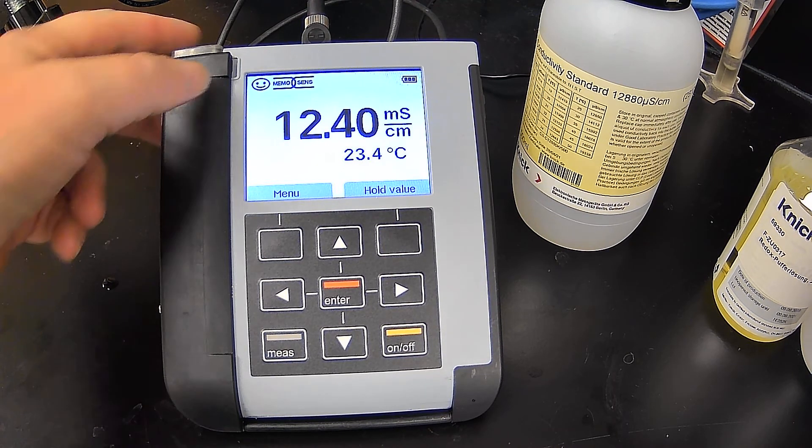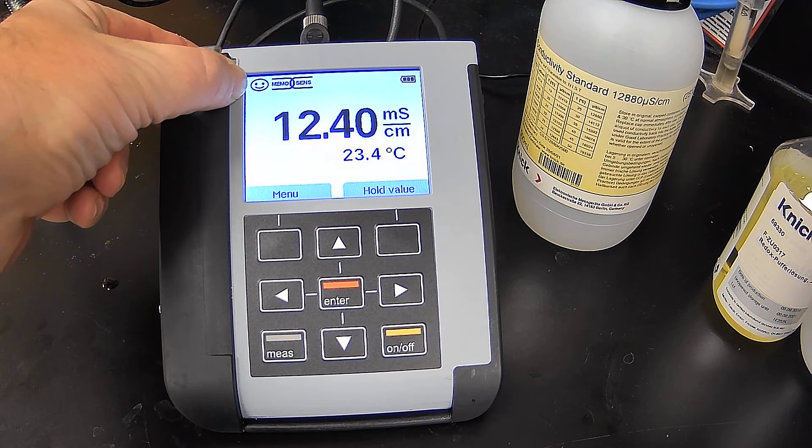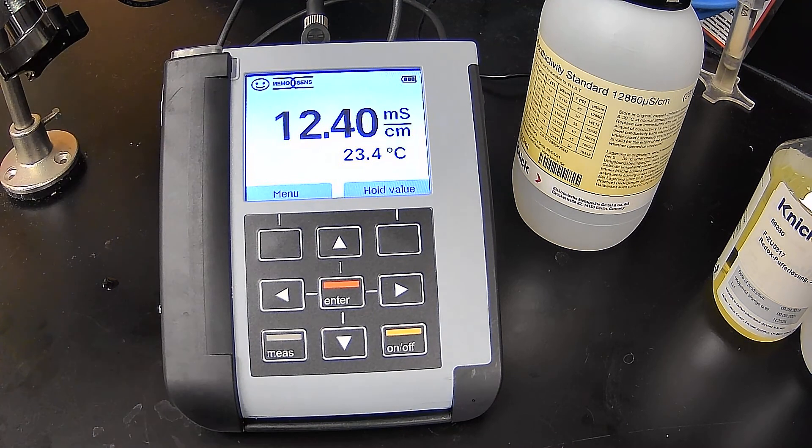And you'll also see that the smiley is there, which is what we like to see. So there's nothing out of order with the cell constant. It took the calibration and we're good to go.